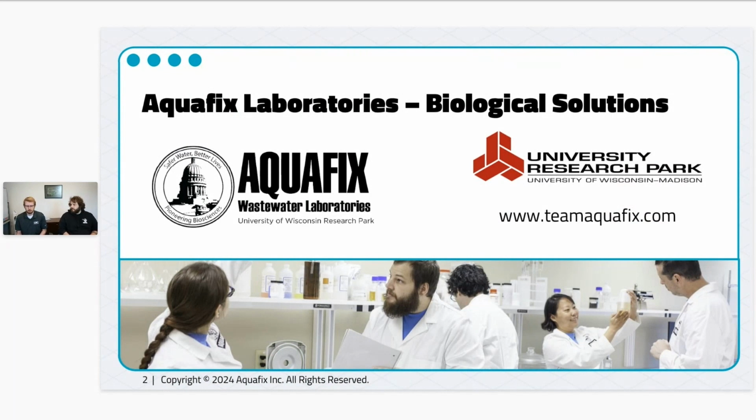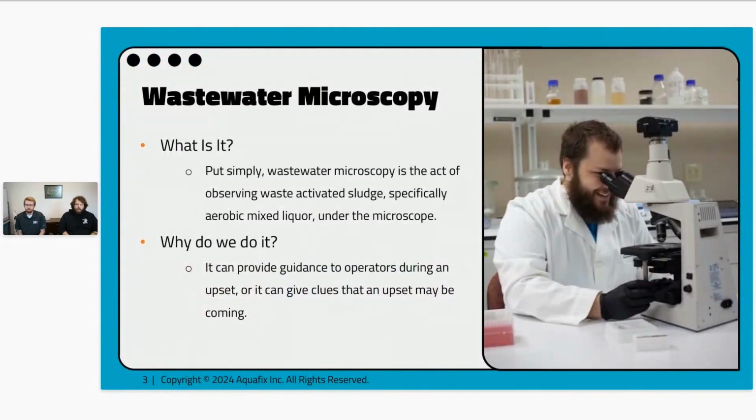So going forward, the goal today is we're going to discuss some of the things that we do in lab, some things that are going to help you out if you're looking to do microscopy on site, and just some other tips and tricks. Generally speaking, today we're going to be going over microscopy overall, some of the things that we look at at Aquafix when we get a sample in and we're doing microscopy, and maybe give you a little bit of guidance on how you can do microscopy for yourself.